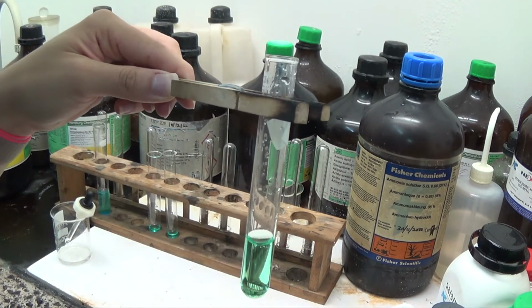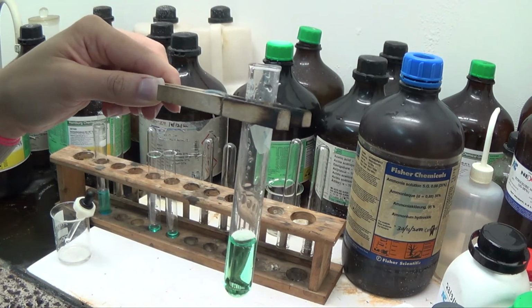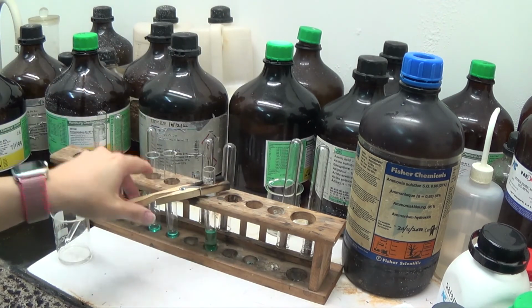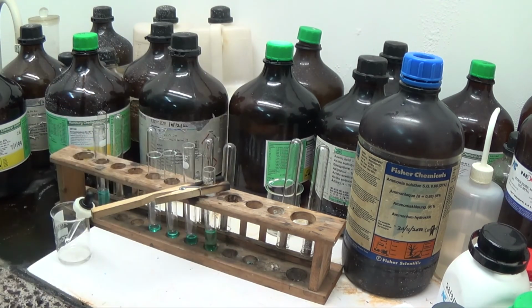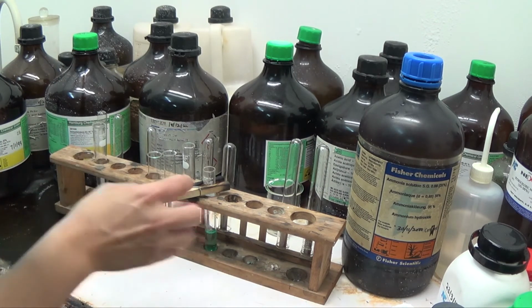So it's Cu2+ and 4 Cl-, so it's going to give you CuCl4 2-. Okay, so that's green in solution. That is using concentrated hydrochloric acid. Just using normal dilute hydrochloric acid is probably not concentrated enough to drive the reaction, as you could see from my earlier experiments. Okay, so that's with chloride.